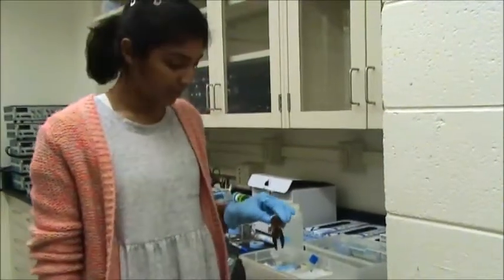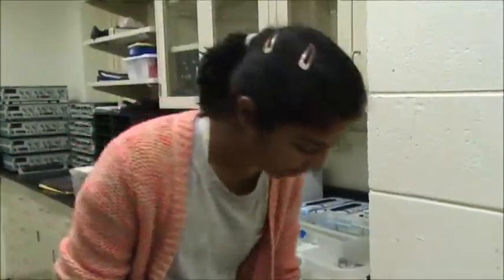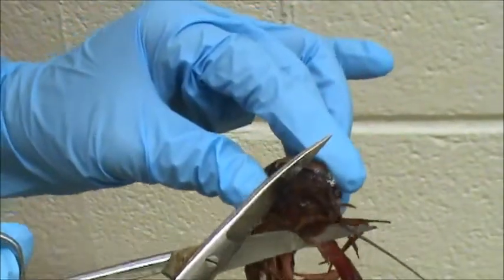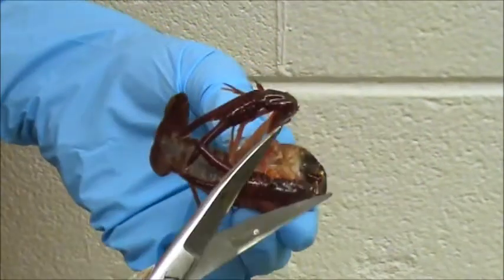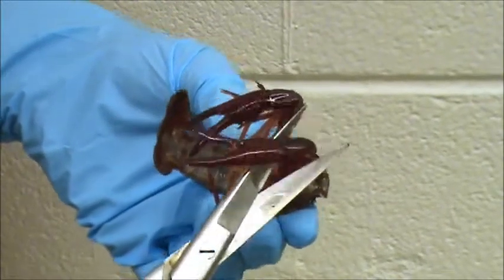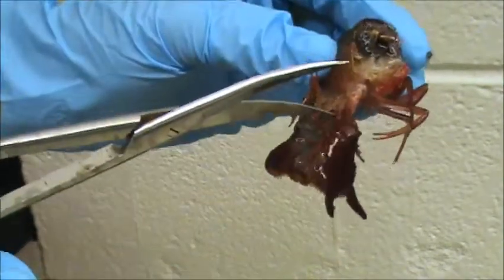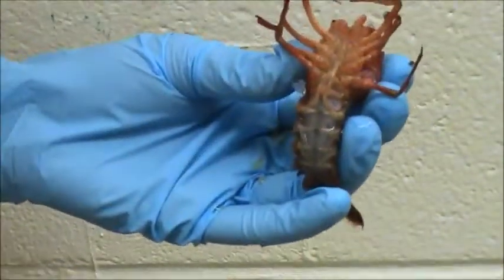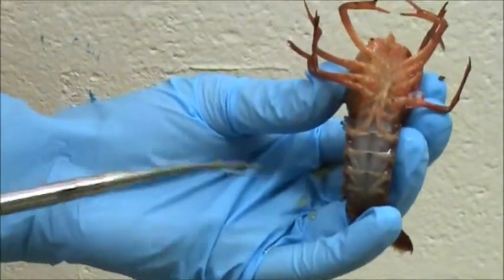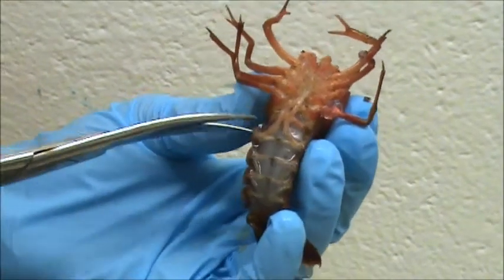So after 10 minutes, we are going to quickly decapitate his head. And now we're going to clip these big claws so they won't hurt you. So now we're going to separate the abdomen from the thorax, and you can see that he's a male from the large stylets. And we're going to try to cut as close to the thorax as possible.